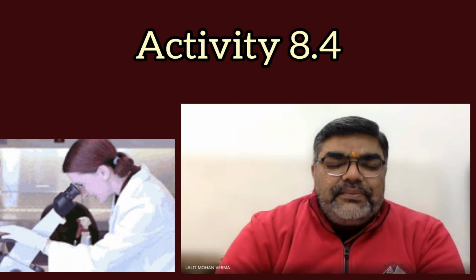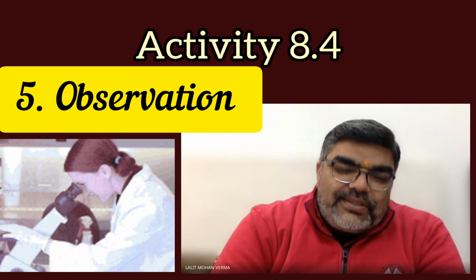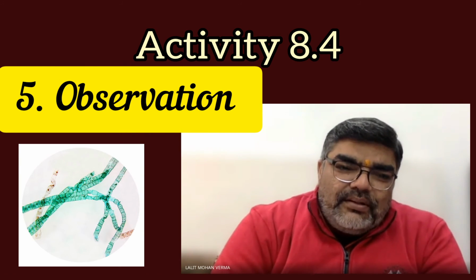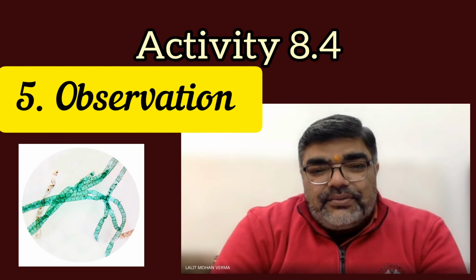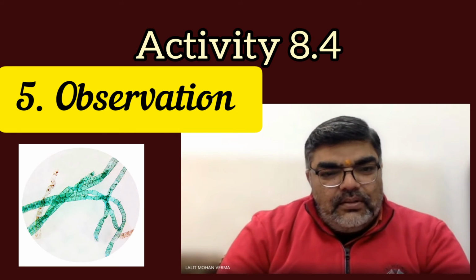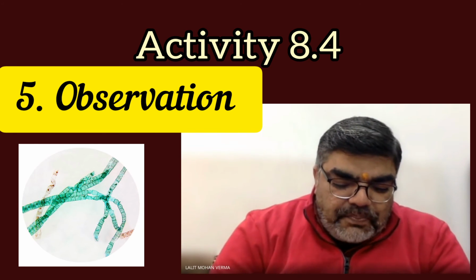Observe carefully. You will find some filamentous structure clearly visible on the slide. Some fragments. This is nothing but the Spirogyra.